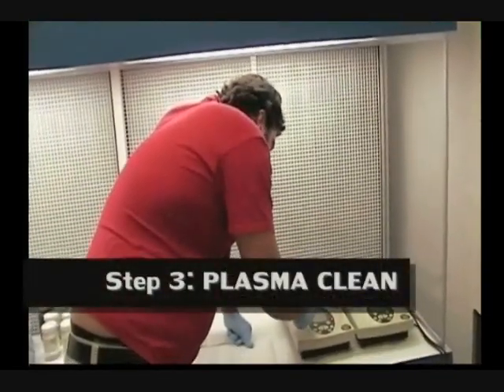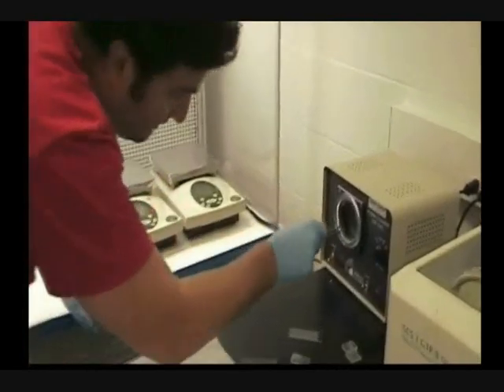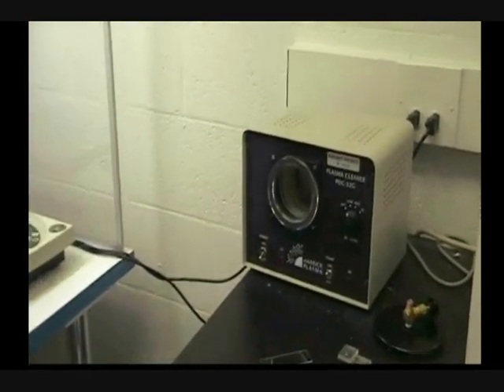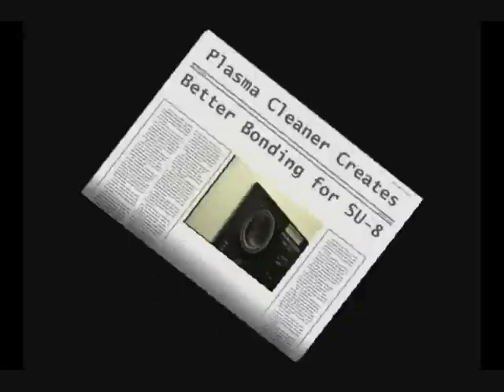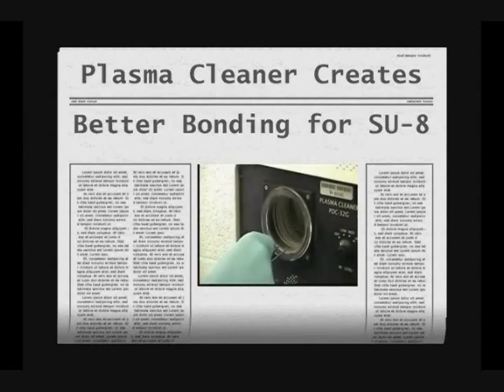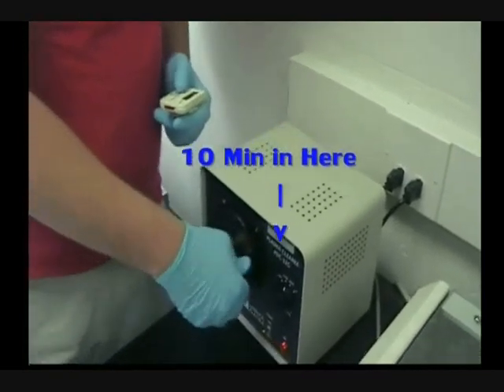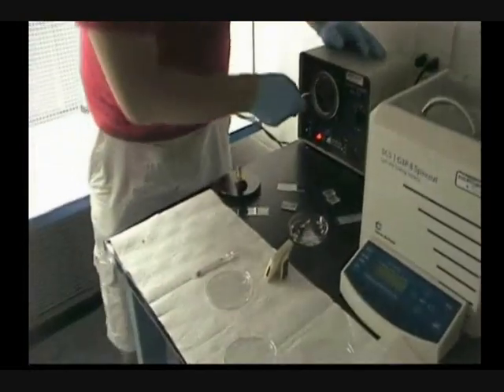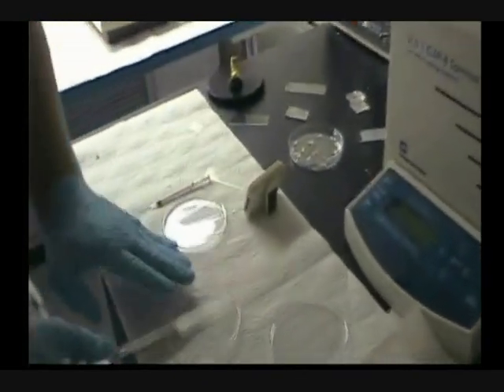Now I am going to place the glass slide in the plasma cleaner to make the surface cleaner for better bonding with SU-8. Now I am taking the glass slides out of the plasma cleaner and I am going to place them on the Petri dish.